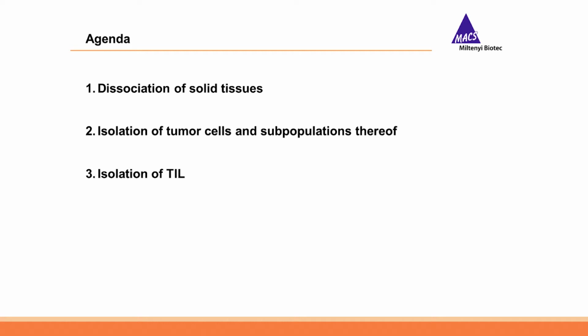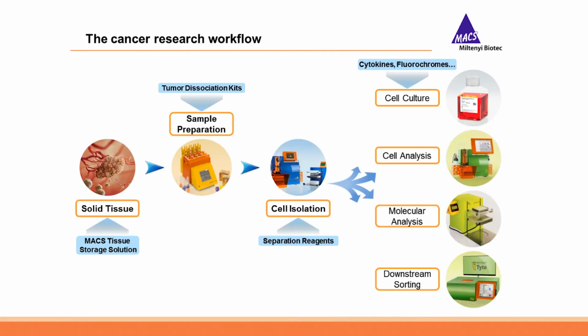Then I want to focus on the isolation of tumor cells and subpopulations thereof, and that will be the major part of this webinar. And lastly, I will also discuss briefly the isolation of TIL. However, there will also be a colleague of mine giving a seminar in particular on this topic.